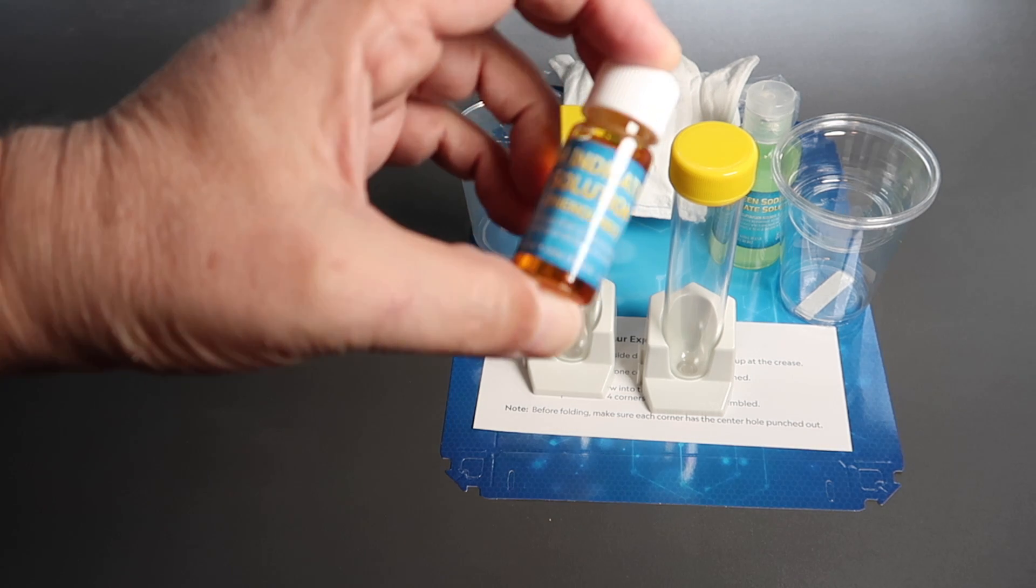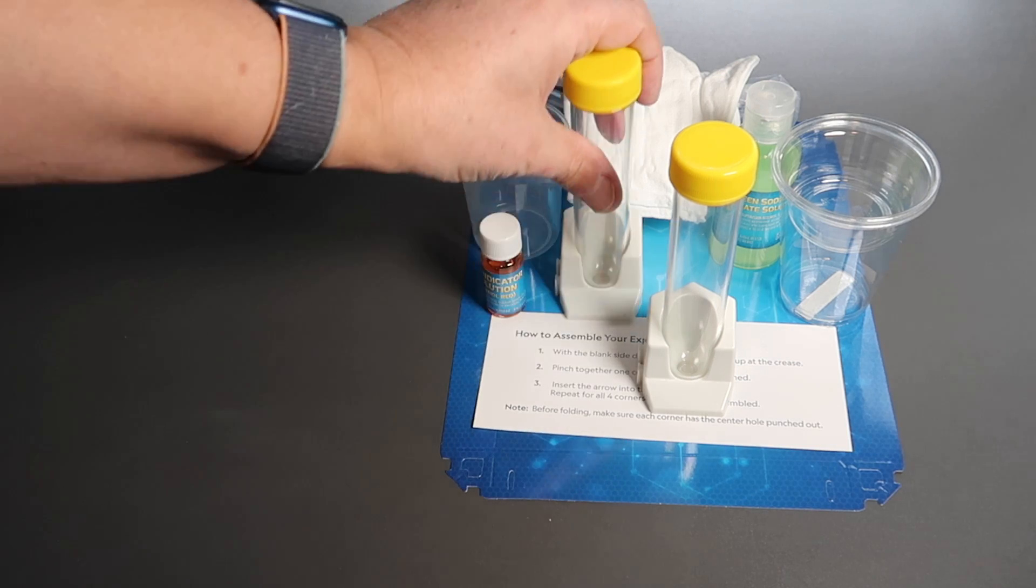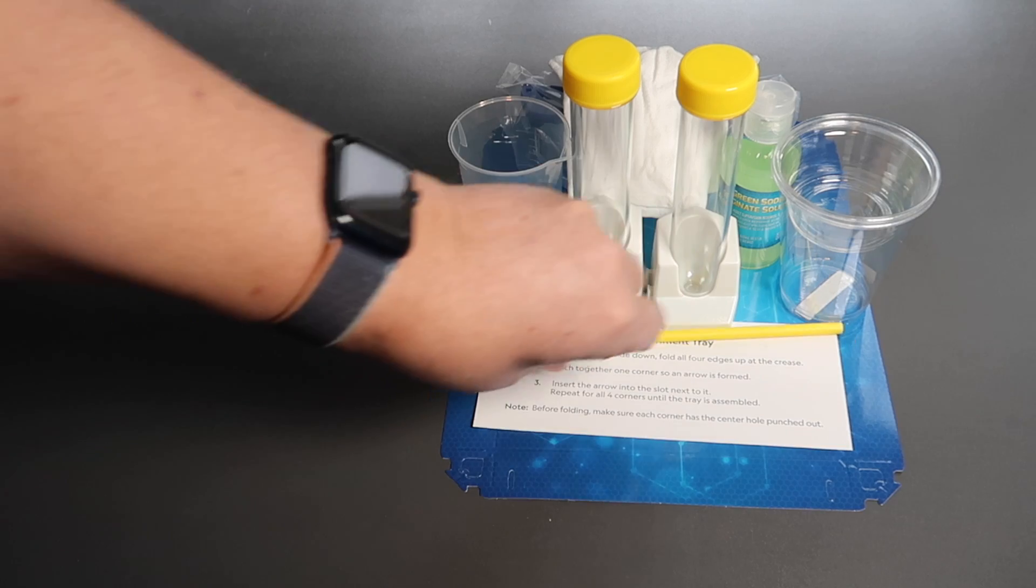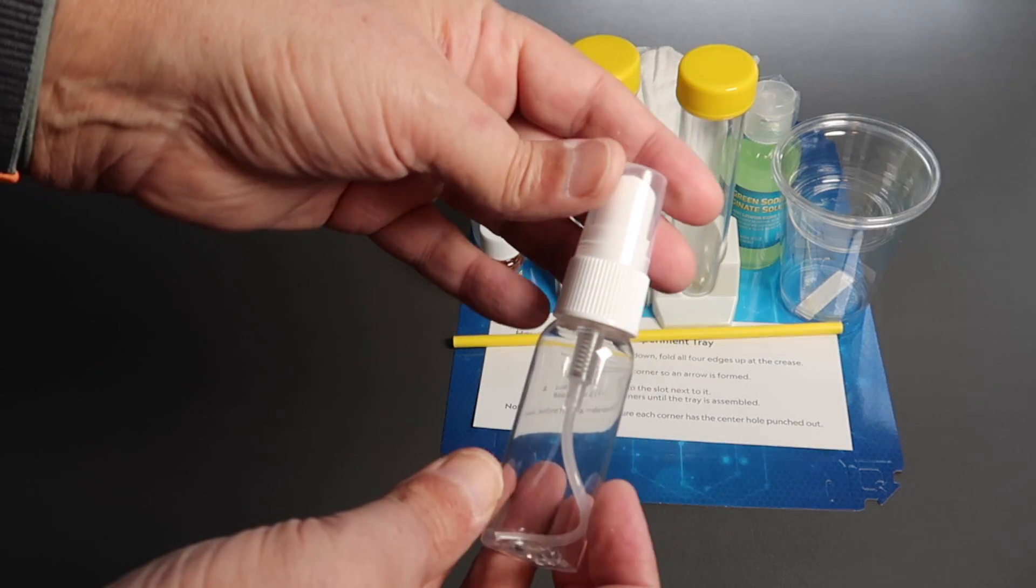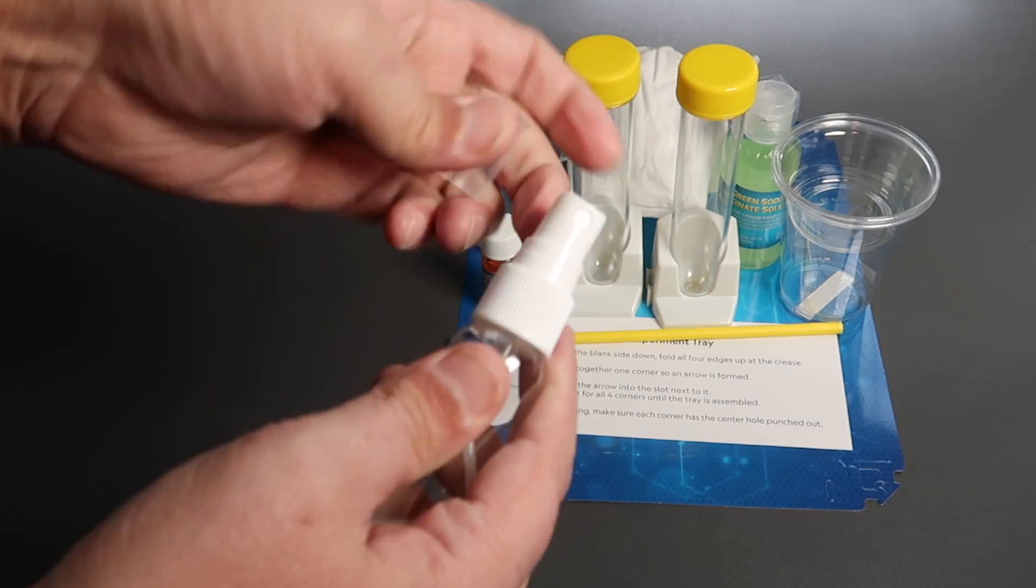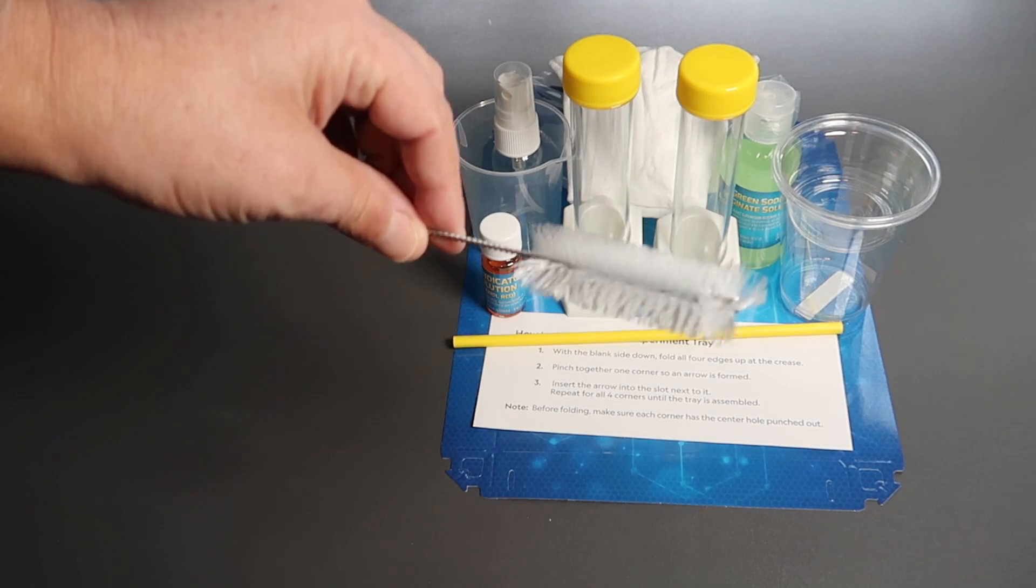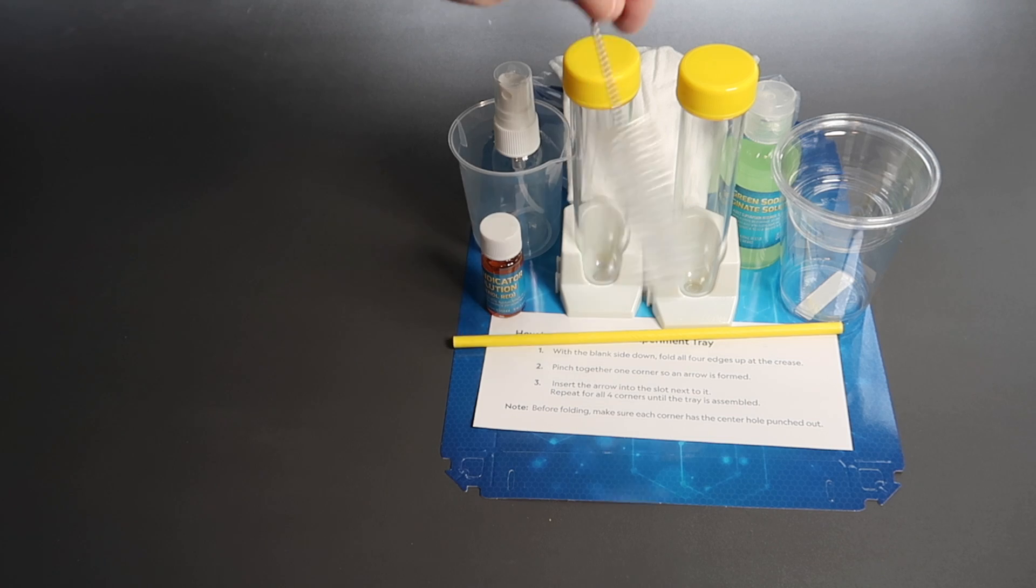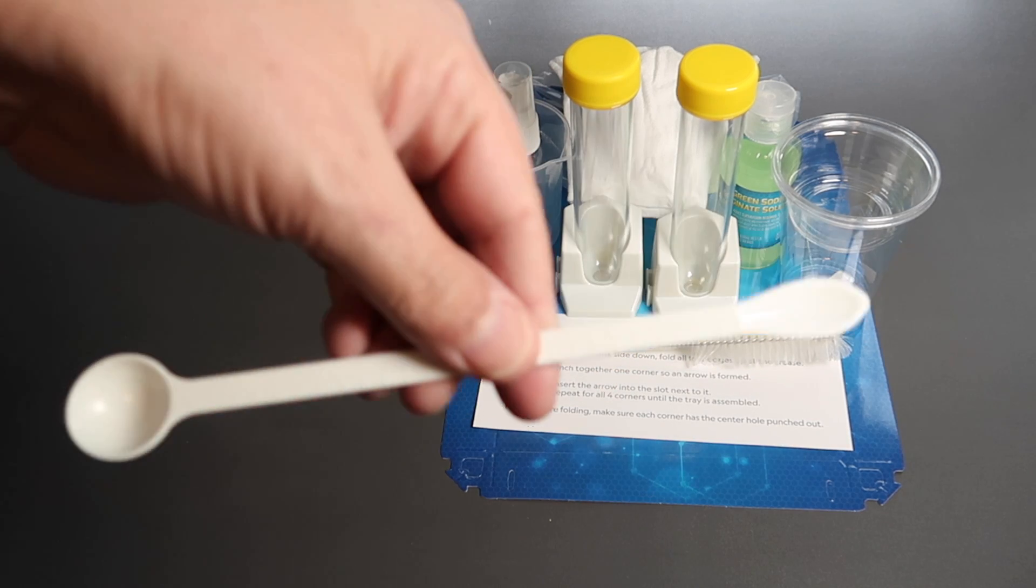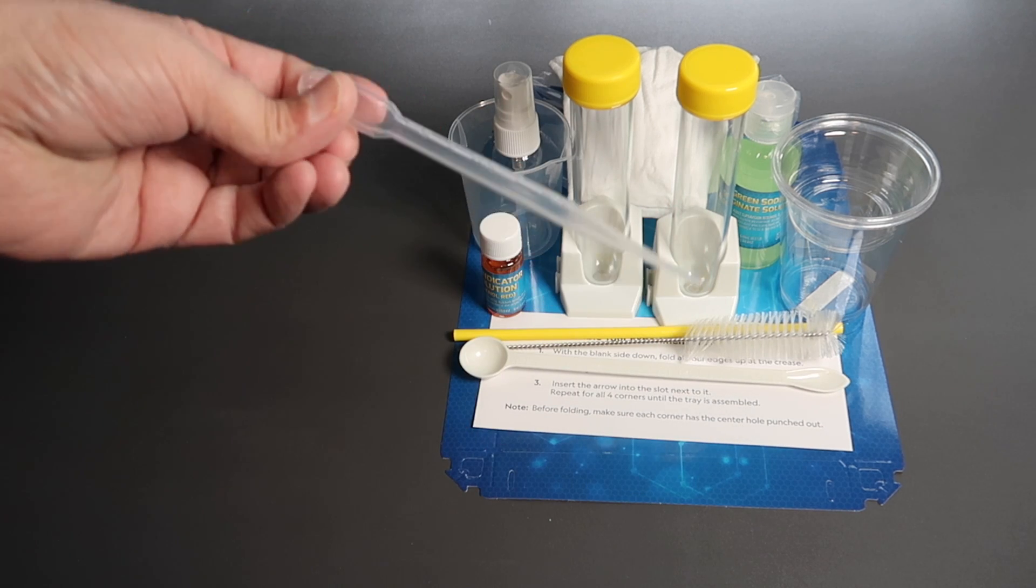pH indicating solution, straw, plastic spray bottle, pipe cleaner for cleaning the test tubes with. They appear to have thought of everything. Double-sided measuring spoon.